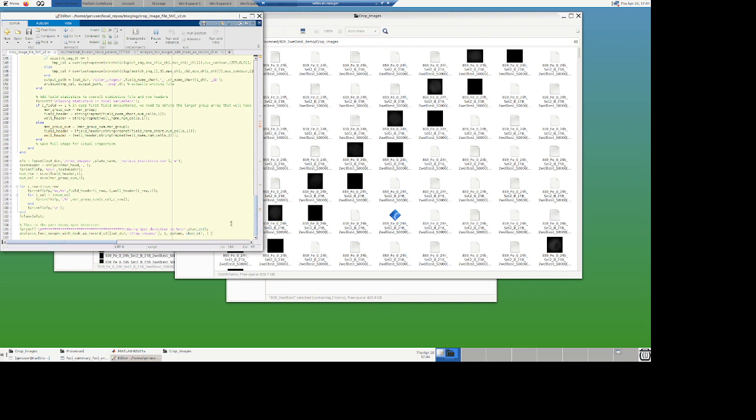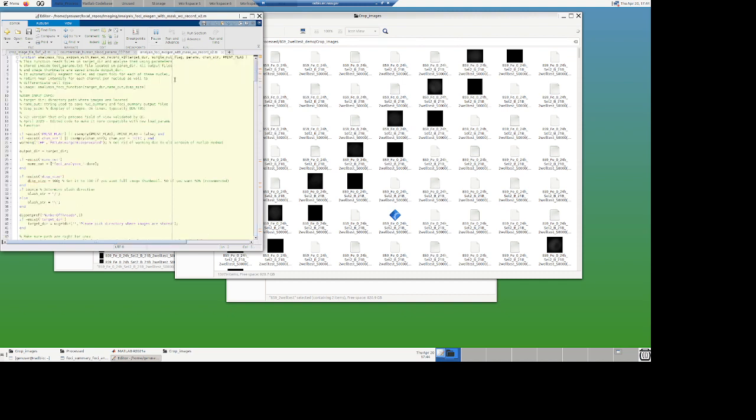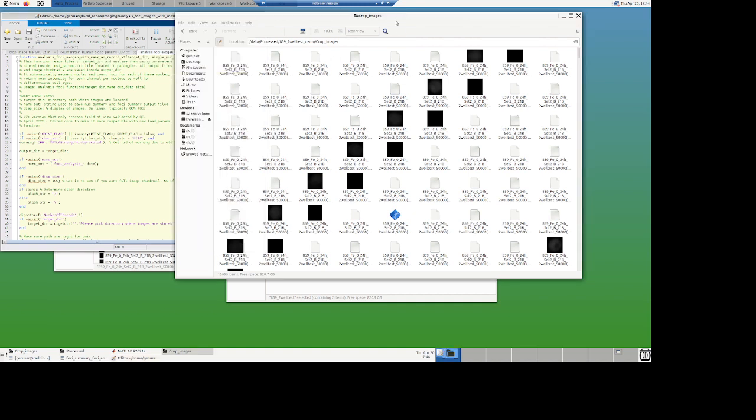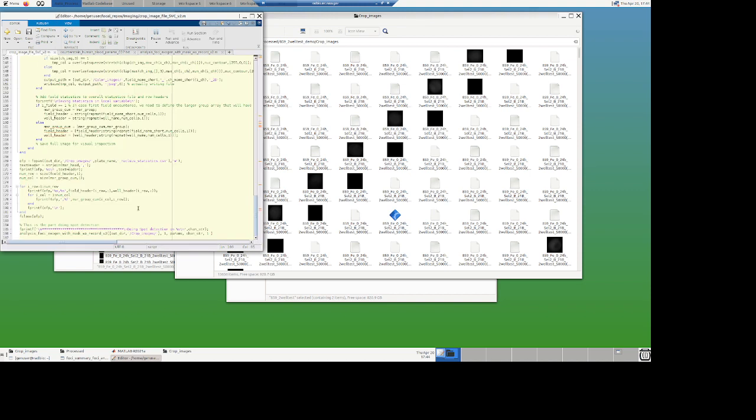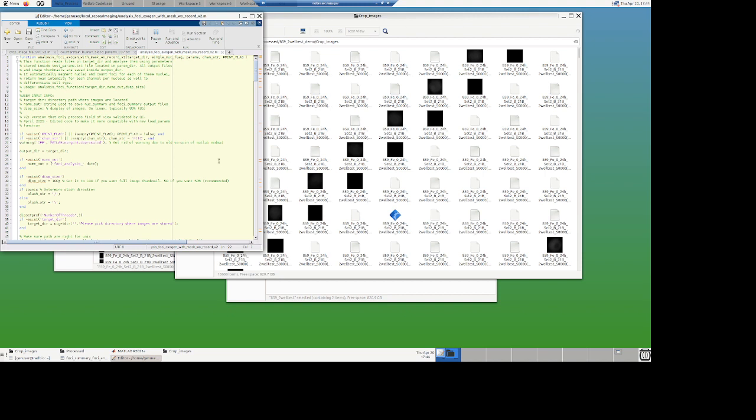And that parameter is something else that I can walk you through quickly, which is, oh yeah, it's a print flag, so it's just to print a bunch of output. Okay, I don't know if that thing will ever show up, but in a nutshell, that's the way the code works. So since it's still thinking, let's go visit this function. To go visit something, you do a Control D. And it should take me to it right there. Here we go.